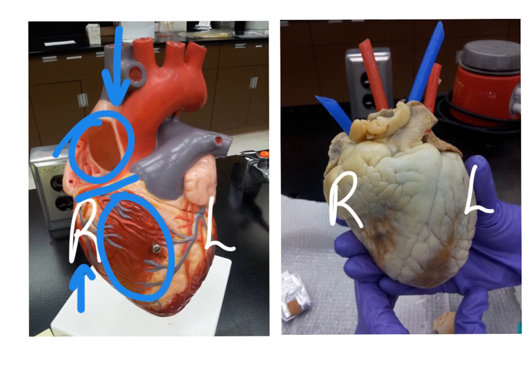From the right ventricle, it will then be pumped out of the heart via the pulmonary trunk, and then the left and right pulmonary arteries — the other ones are on the back.